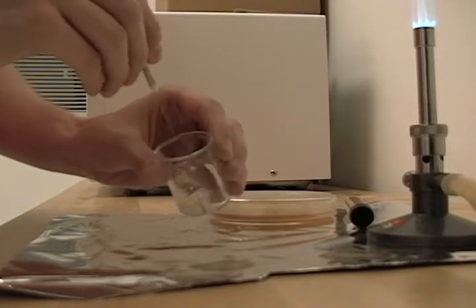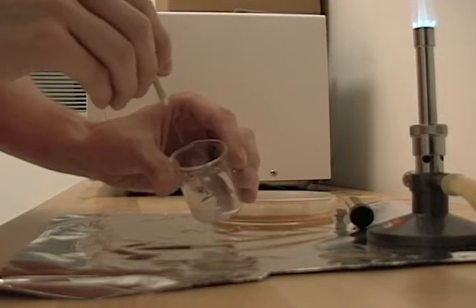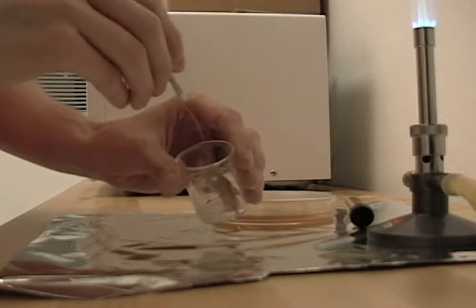So now I'm just mixing up the yeast colonies that I've collected off the plate so that we get a uniform mixture, more or less.